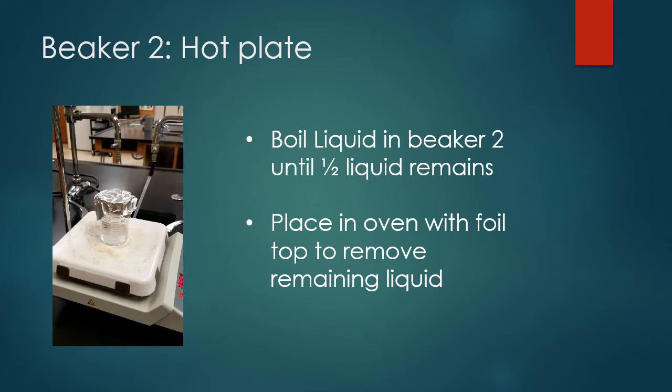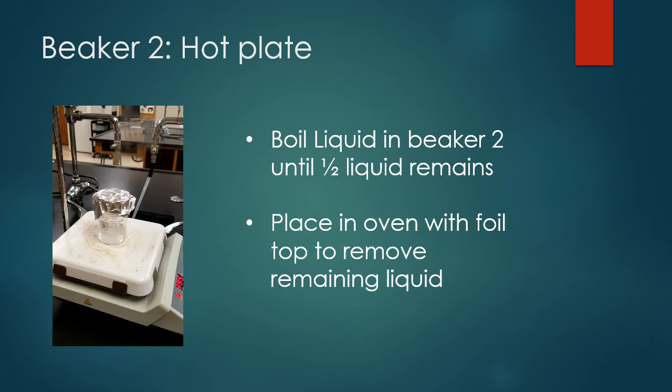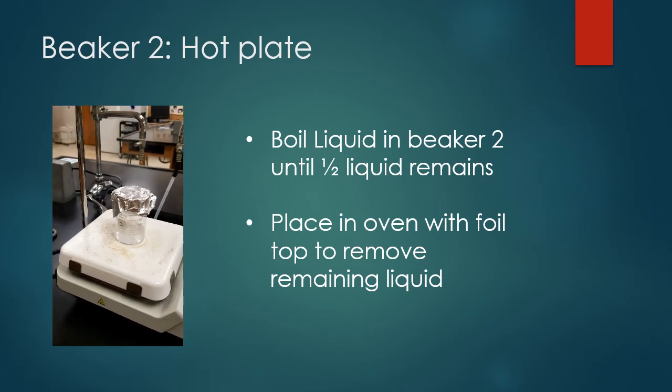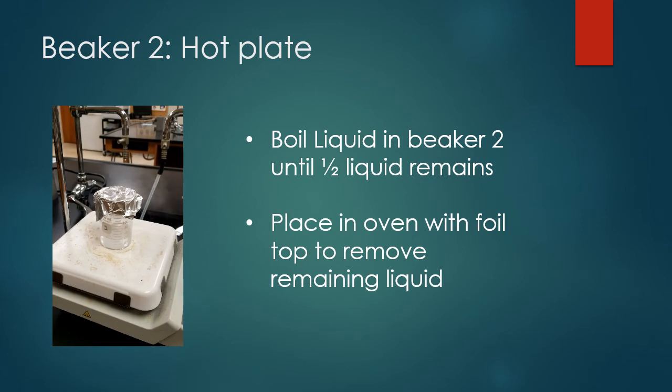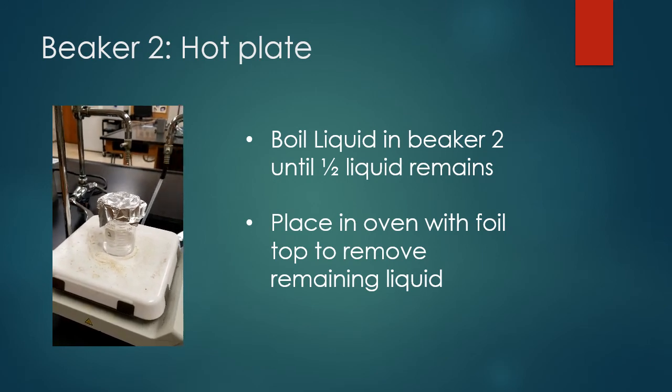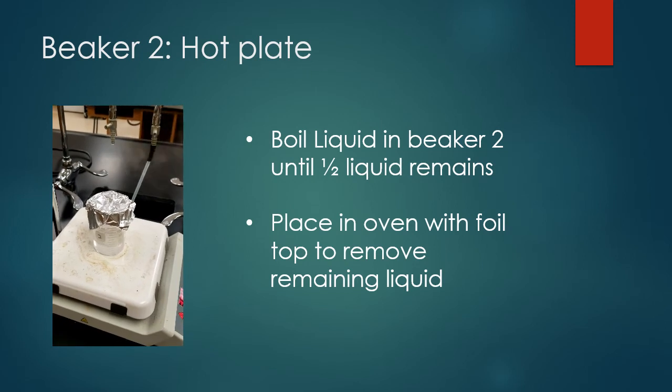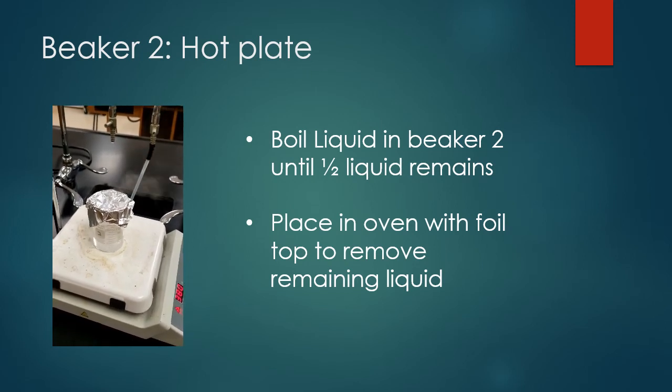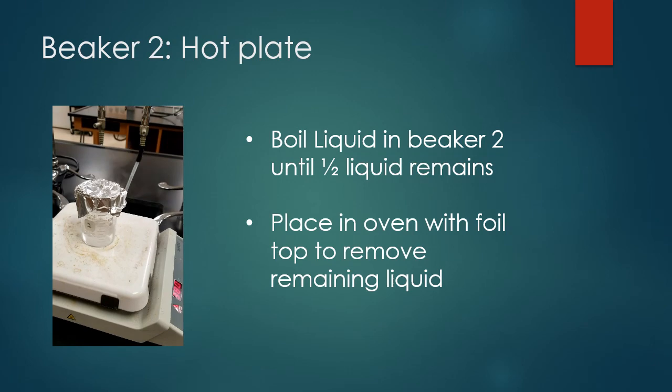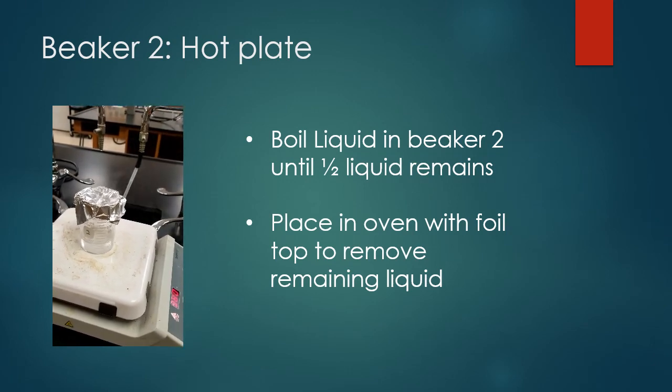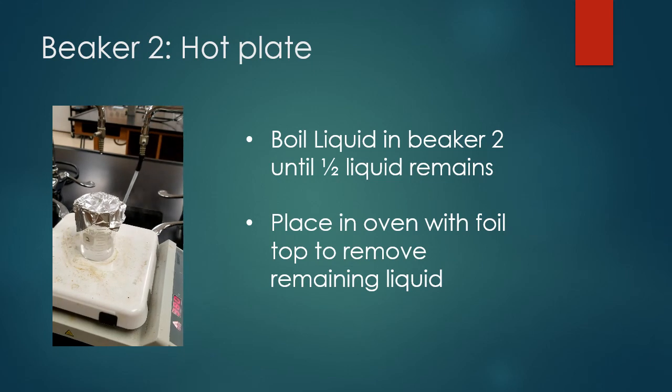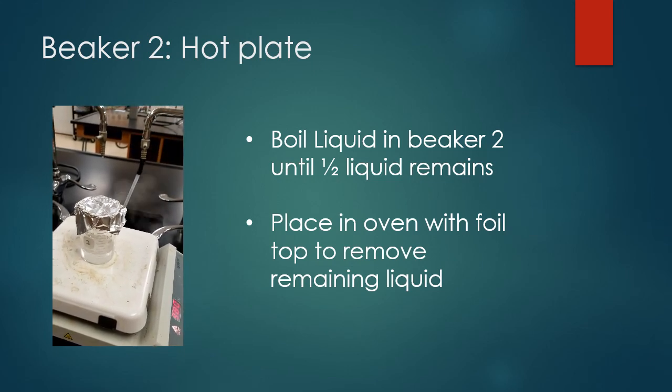Here we have the contents of beaker two. That 50 mils of DI water that we originally stirred our solution with, and then the extra 20 mils to help us rinse and filter for the gravity filtration. We are taking that and heating it up. What we're trying to do is boil off all the water. You can see we have a piece of tin foil on the top with a hole in it. The reason for that piece of tin foil is you can see how vigorous it's boiling. We don't want any of the solid to pop out of the top as it's boiling. That piece of tin foil will catch any debris trying to pop out of the beaker.